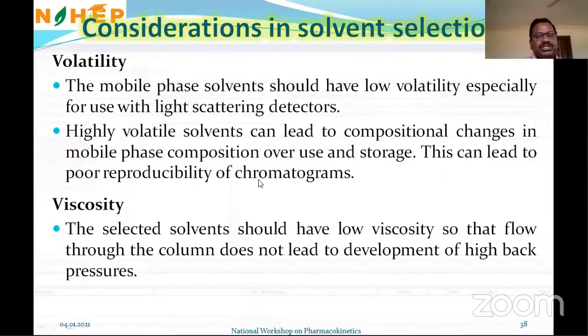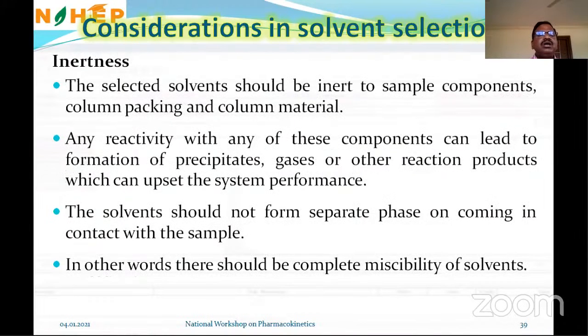Then comes the viscosity. The selected solvent should have a low viscosity so that the flow through the column does not lead to the development of a high back pressure. It should flow easily through the column.